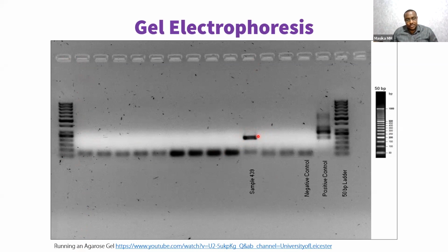the dye that binds to DNA. So for you to see it, you have to use an ultraviolet imager. There's a gadget, we call it UV. It uses UV to shine on this gel, and then you see all this on a screen. This is taken now from the screen using the UV light. So the imaging system is a UV system, and you are able to see the DNA because it is bound to the compound that can release light under UV.